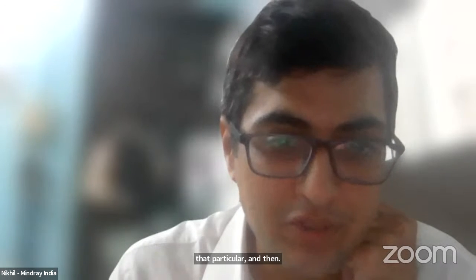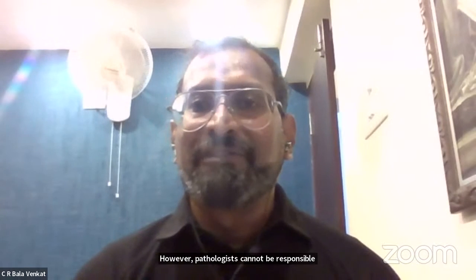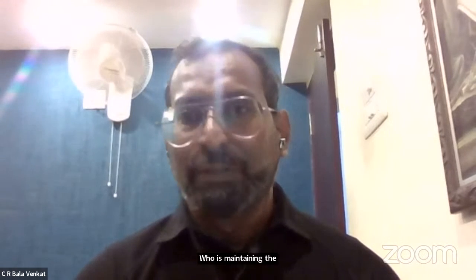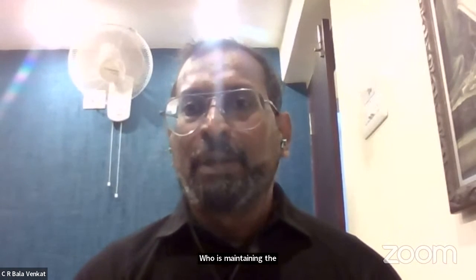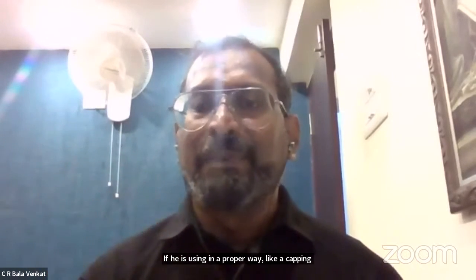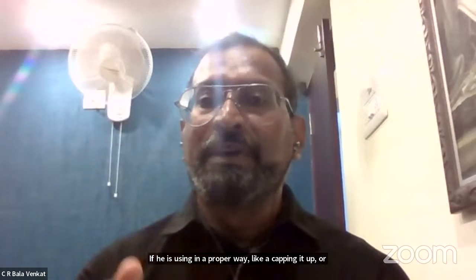Yeah, one more repeated question. Is the pathologist or technician responsible for controls going out? I think it's a dual responsibility. However, pathologists cannot be responsible, because it is the staff who maintain the controls, not samples, controls. Are they using them in a proper way, like capping it up, or when mixing, they open it up and do it.